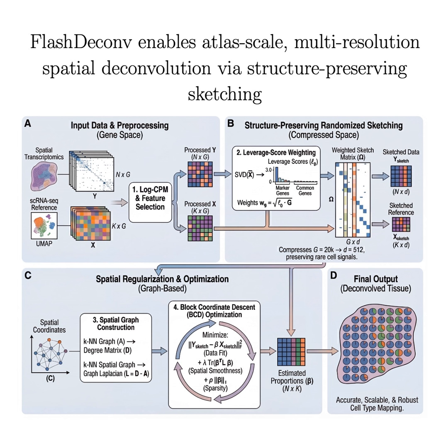Okay, let's unpack that core conflict right now. Why does the standard way of analyzing these huge genomic data sets blind us to the most important rare players? Well, it all comes down to how we've traditionally defined what's important in a data set. When bioinformaticians do dimension reduction, and you have to, with 20,000 genes, they almost always rely on one thing: variance. Variance, which is essentially how much a gene's expression changes or fluctuates across the whole data set. Exactly. We can think of it as measuring how loud a gene is. That's a perfect analogy. And it feels intuitive, right? If a gene is changing a lot, it must be doing something important.